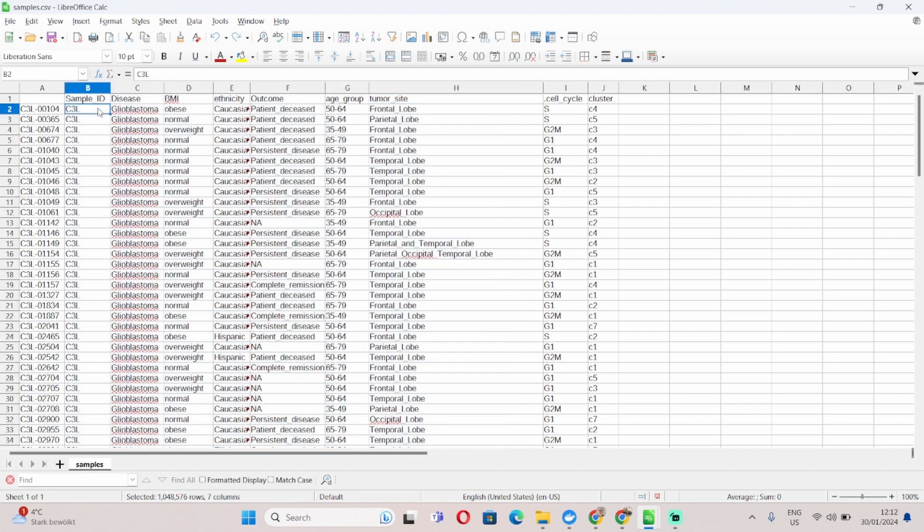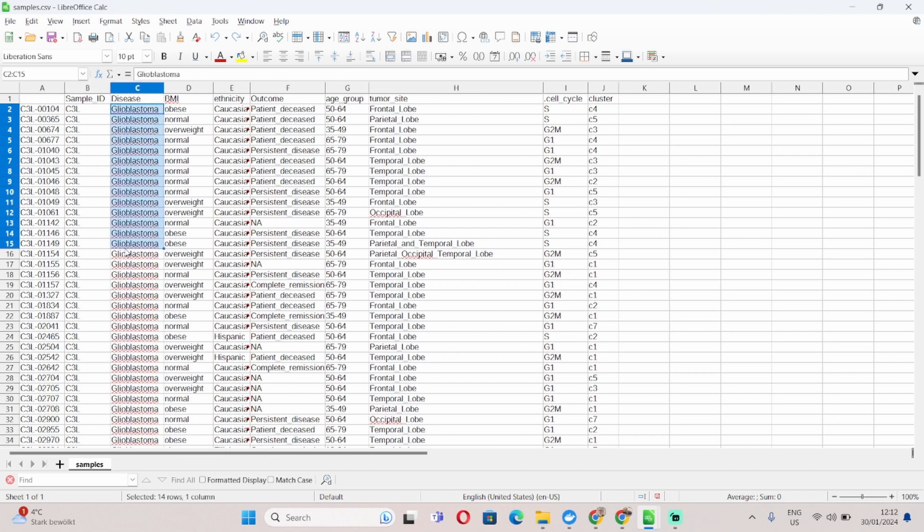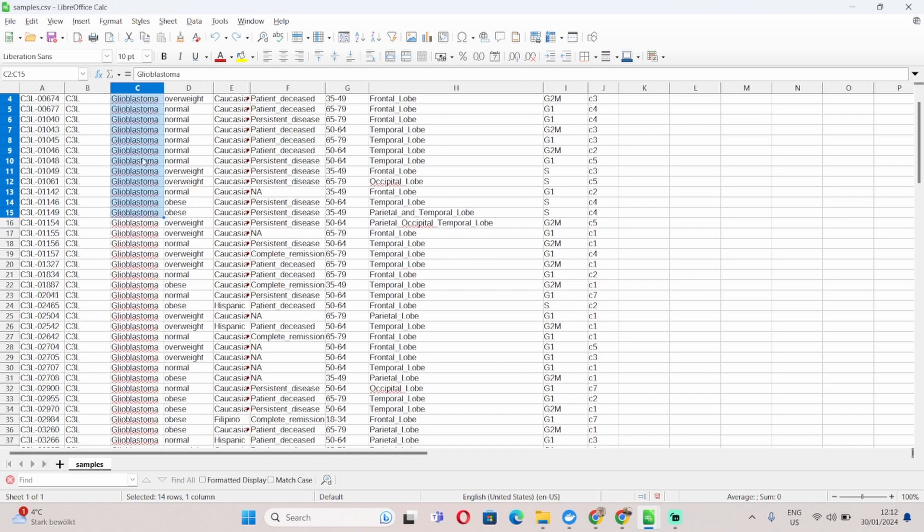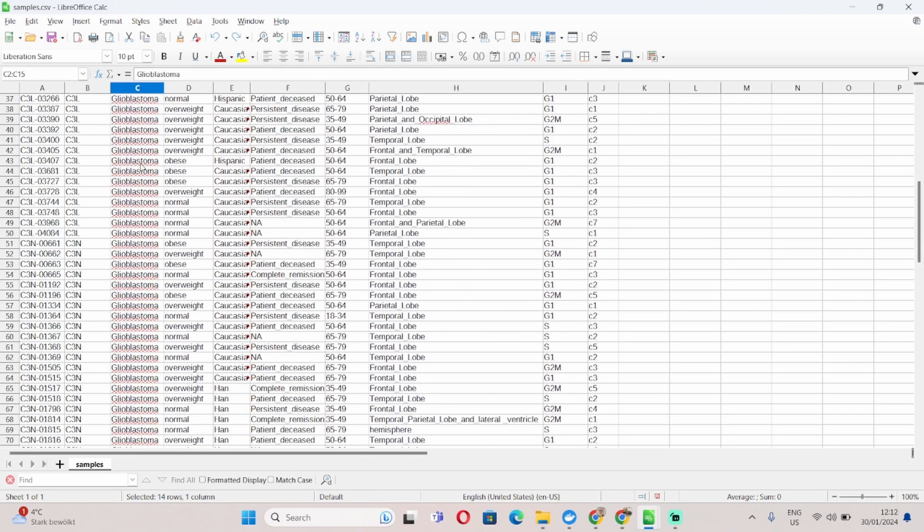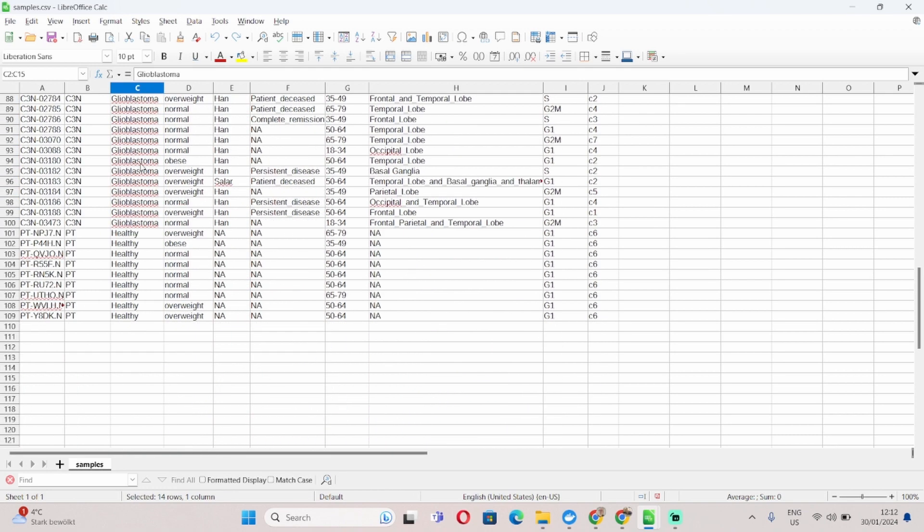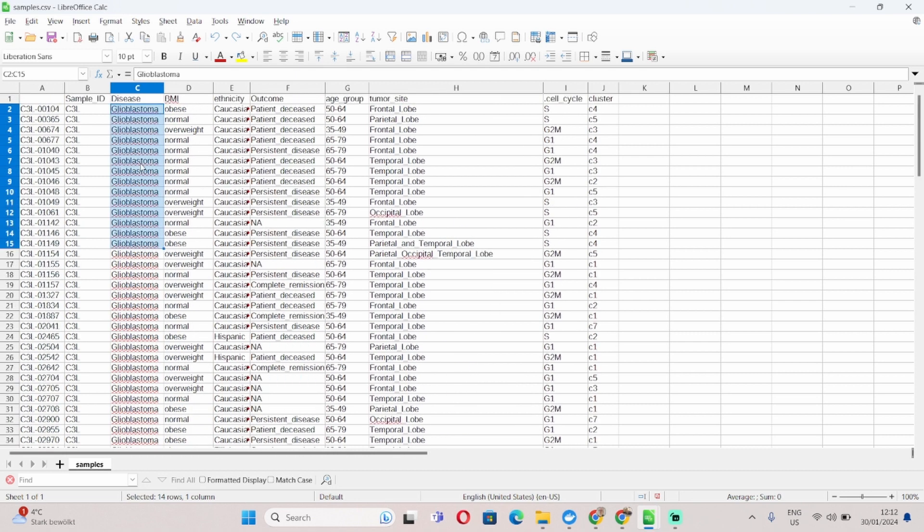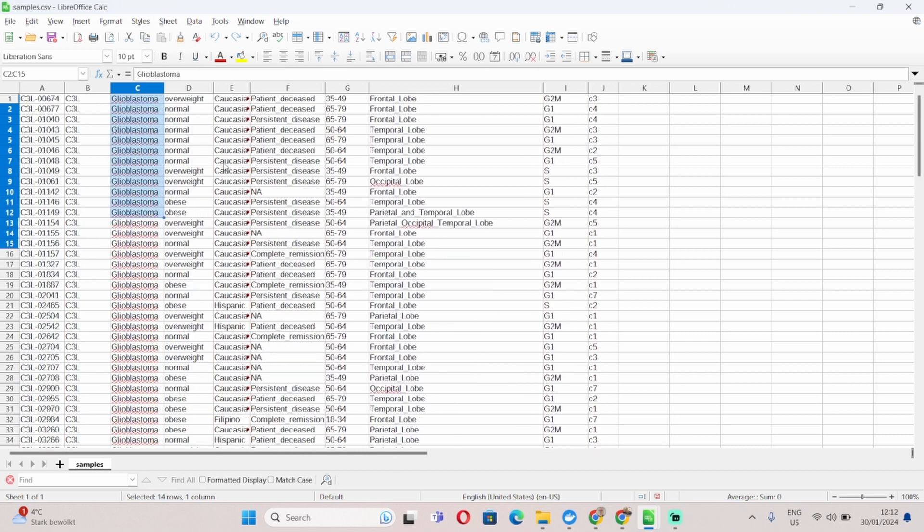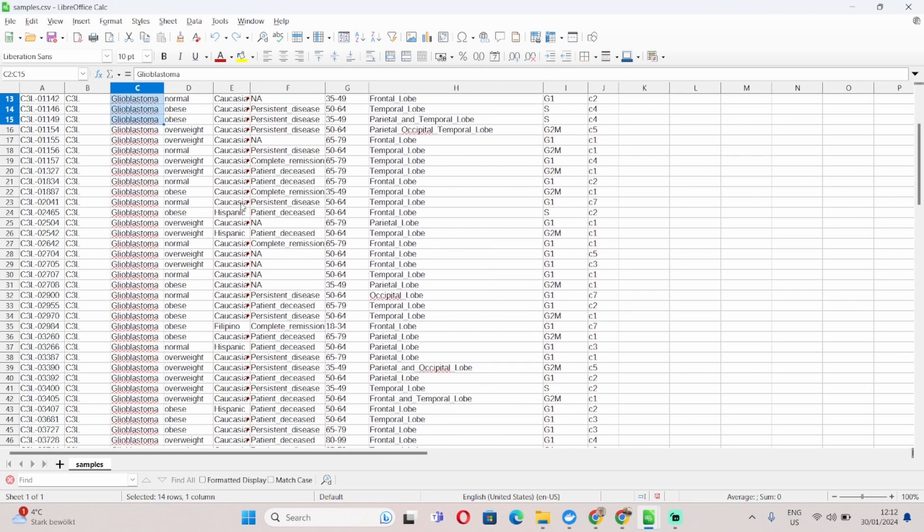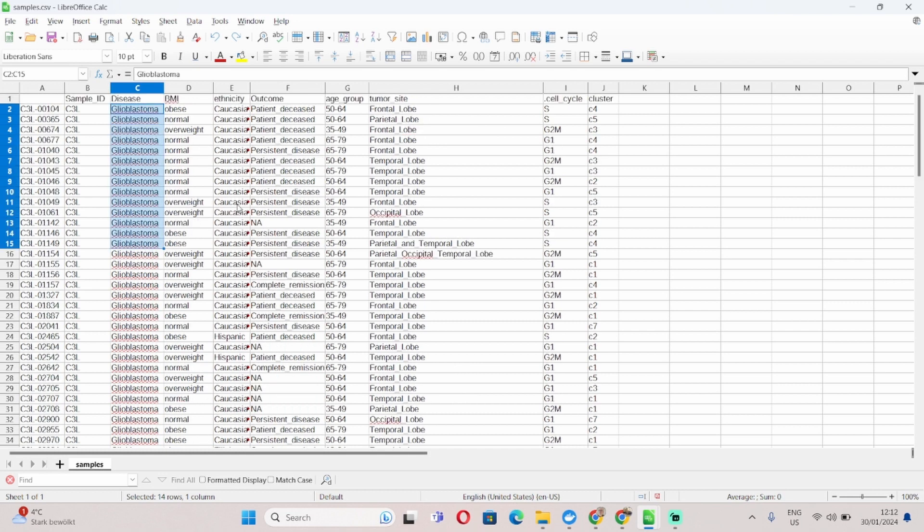So when it comes to naming the different phenotypes, obviously give it something meaningful. So in this case for example you can see I separated samples between glioblastoma and healthy, or I have ethnicity, Caucasian, Asian, Hispanic, and so on.